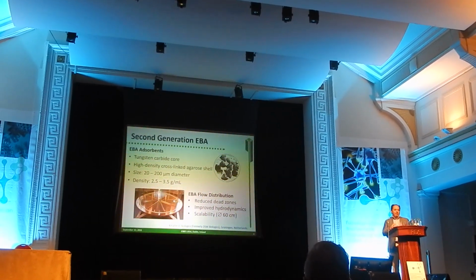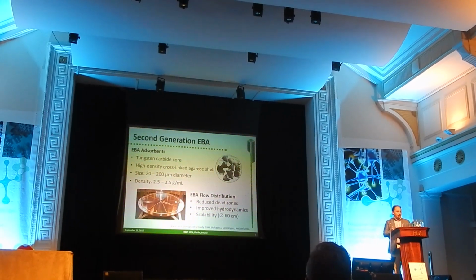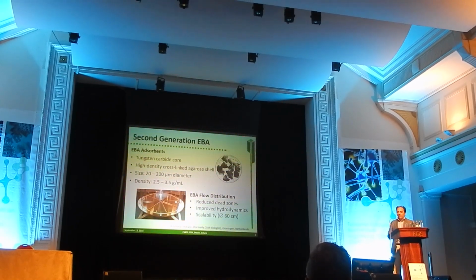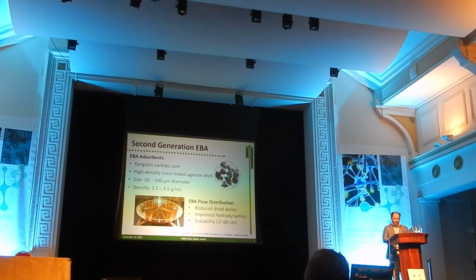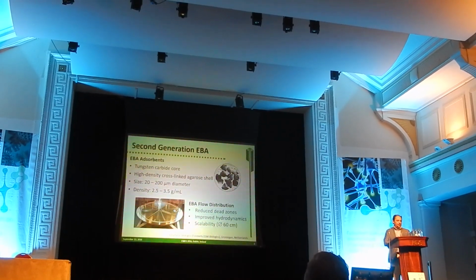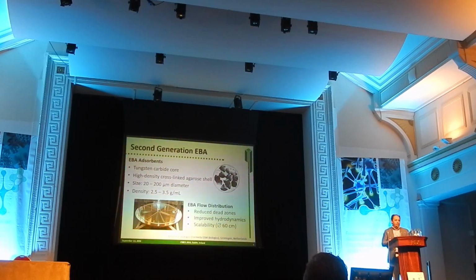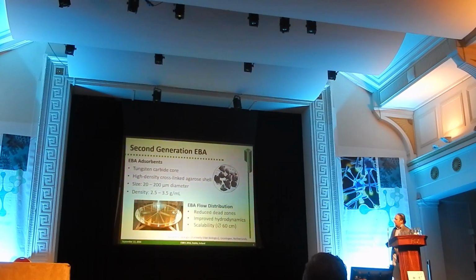So having a bead which is smaller in diameter would imply that less diffusion is needed inside the binding sites, and then of course you will get a better performance. At the same time, if the particle is denser, you could flow the system with relatively higher flow rates, and then productivity could also be increased or at least maintained. So smaller beads, higher density.